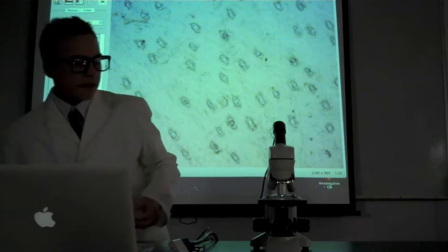After you've peeled it off, stick it on a slide in the microscope, get your focus, and have a look.